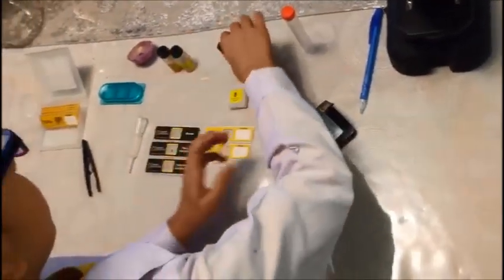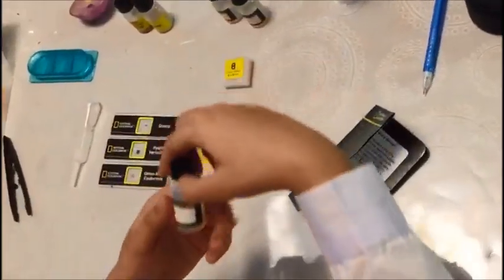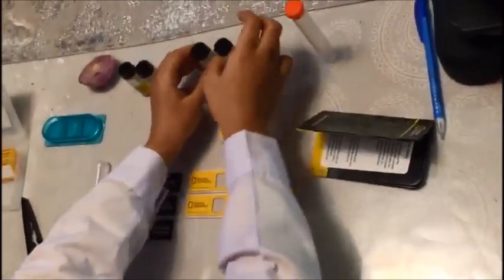It also has these little specimen jars with a label that says specimen name, and over here you can write them. There are three unfinished ones that you can finish and customize yourself, and there are two with yeast, which is a fungus, and brine shrimp eggs.